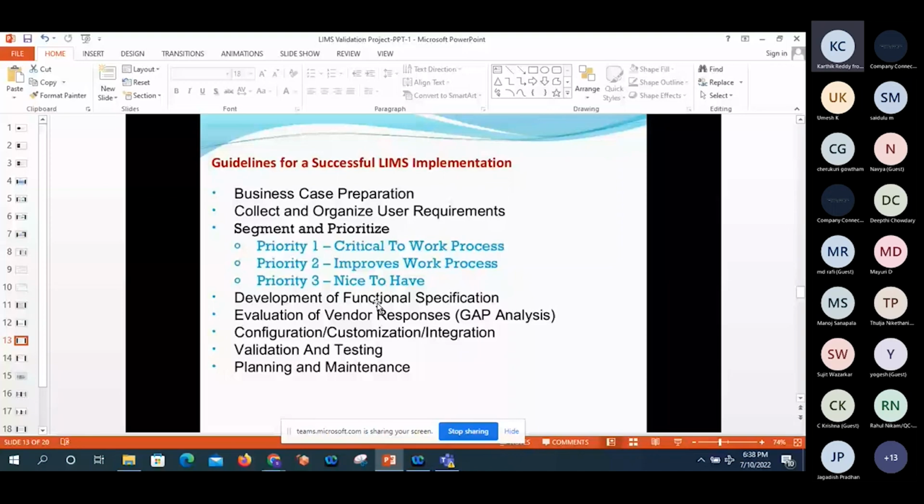unique and should be according to the functional specification generally provided by the vendor according to our URS. The functional specification should be stringent and in a descriptive manner. Additional to the functional specification, there is an FDD that will be coming from the vendor.